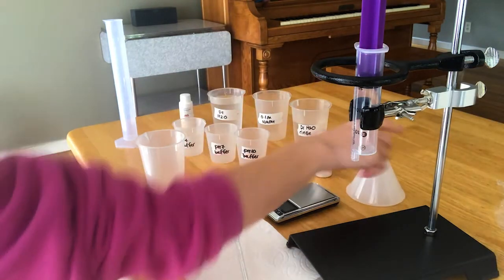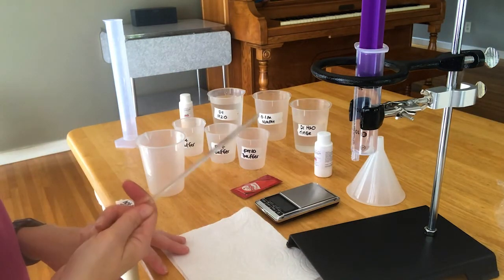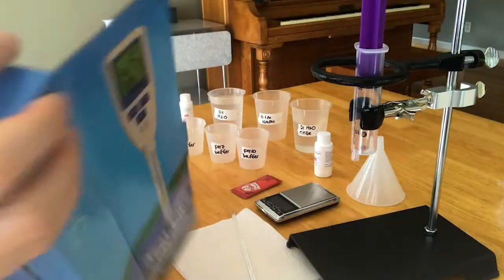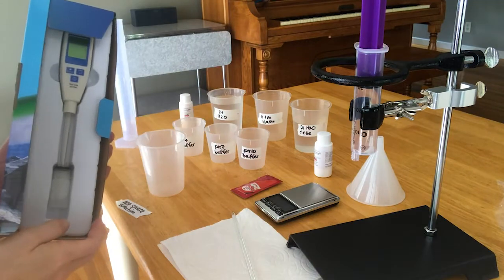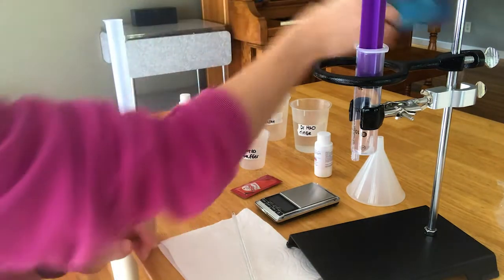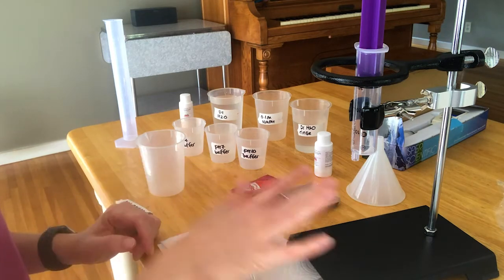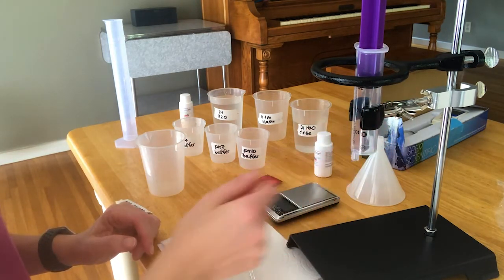They say funnel but I didn't end up using it, and same thing with this stir rod, which was really hard to get out of the packaging. You're also going to need this pH meter and this little balance. Additionally you're going to need a ring stand and a clamp.